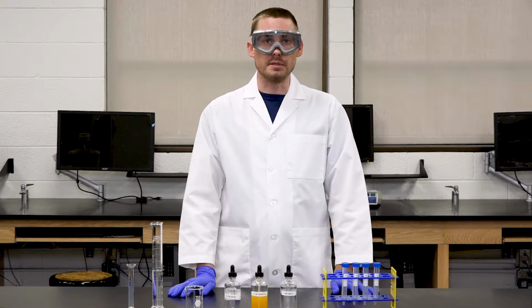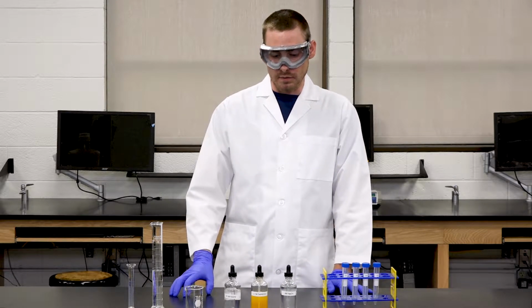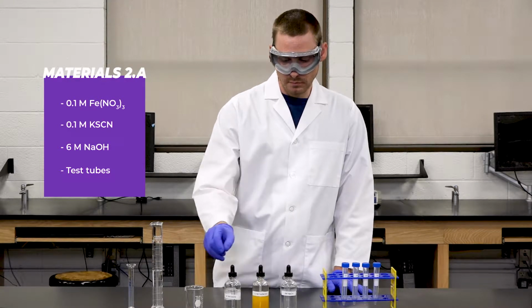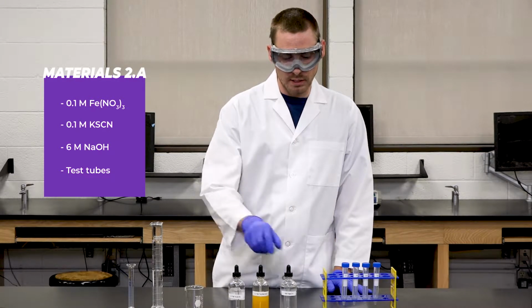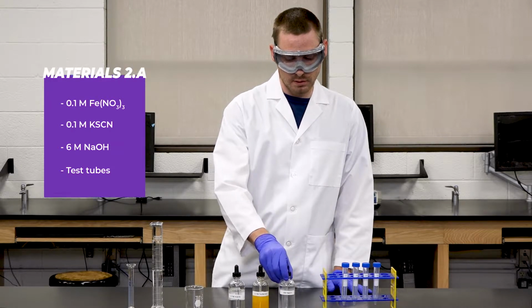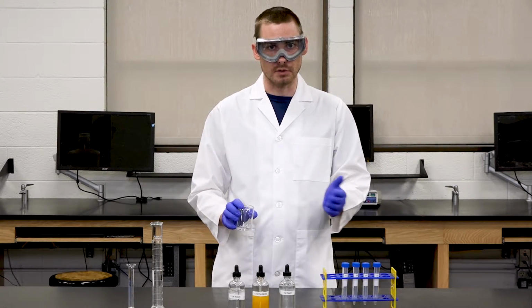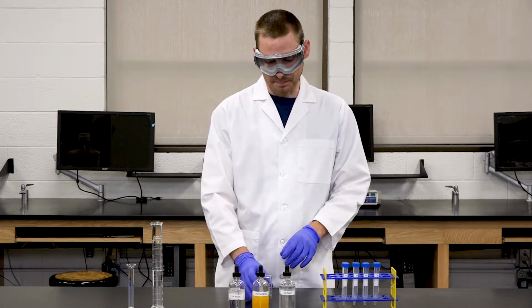So for this experiment, experiment 2A, we're going to be talking about the complex ion effects on equilibrium. For this experiment, we'll be using a 0.1 molar solution of iron nitrate, a 0.1 molar solution of potassium thiocyanate, and a 6 molar solution of sodium hydroxide. To begin, we're going to create a solution in a 50 milliliter beaker that we'll be using to fill these test tubes to show the color changes as we add different reactants or products and change the equilibrium.